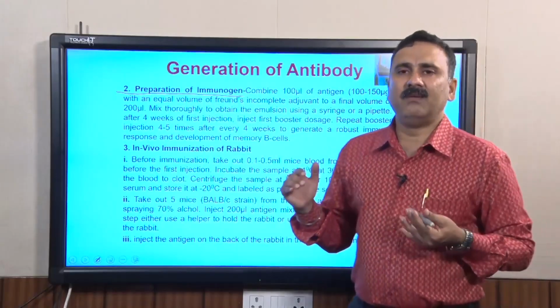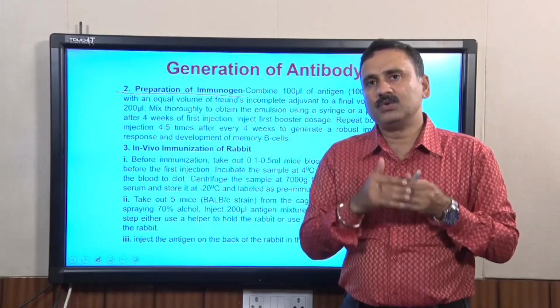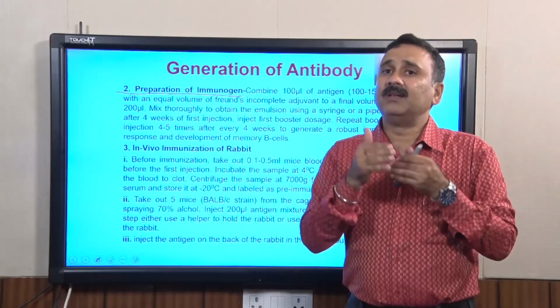We do exactly the same here, where you do a primary injection and a secondary injection.